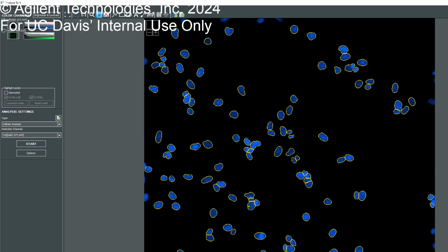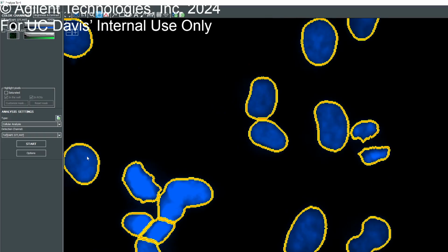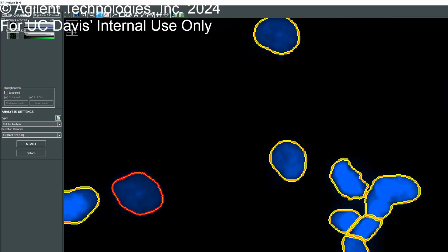All right, perfect. So now if you pay attention on the right side, we see all the image level results here. So it has the cell count, the average size, the average area, the total sum area, the intensity, the mean intensity, and everything else. If you click on any of these objects, it's going to also populate those values here on object level details. So you have single cell value. You actually get cell by cell level information, which is very helpful.